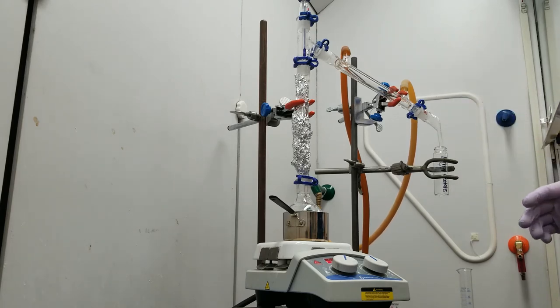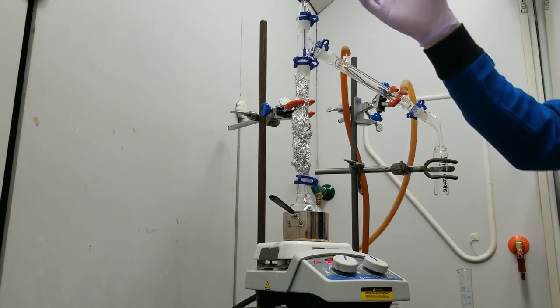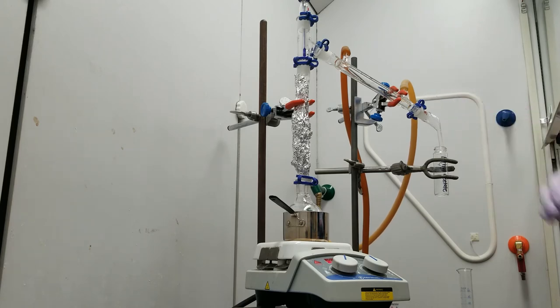So for now, I'm going to go ahead and let this thing run. I'm going to come back once I actually see some temperature increasing and some dripping coming out into my collection flask, and then we're going to talk about the rest of the lab from there.